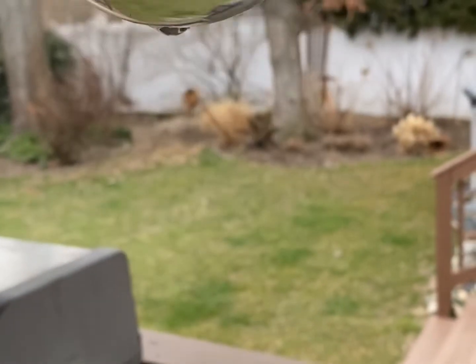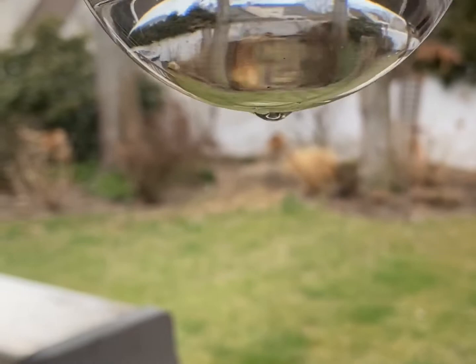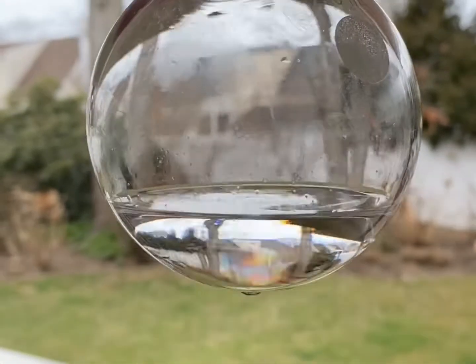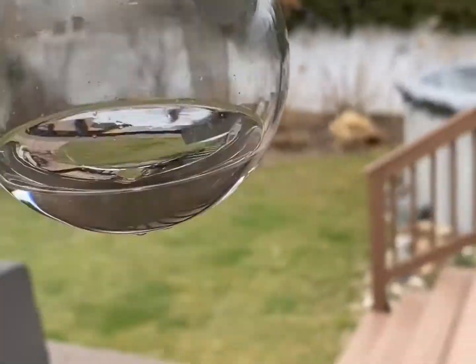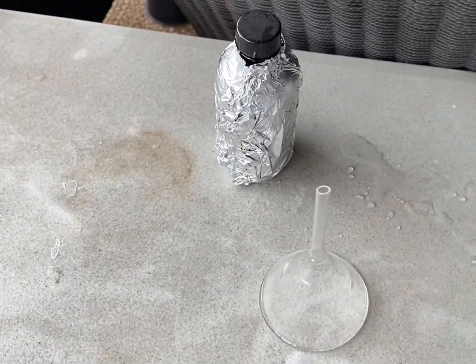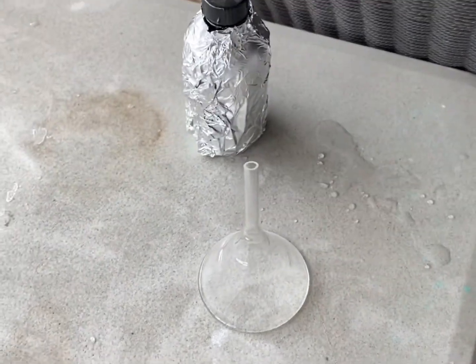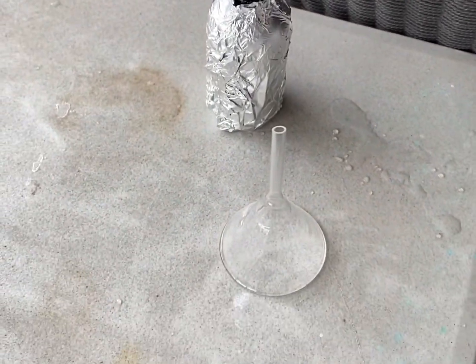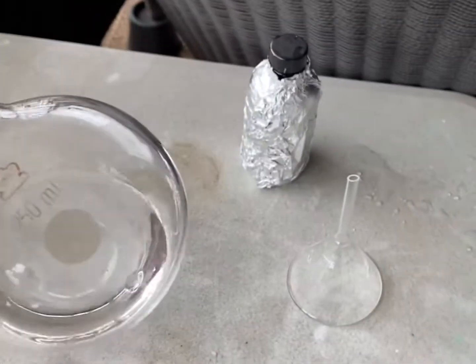Here we have our final yield of chloroform, about 75 ml, to give a 55% yield. And as you can see with chloroform, it has a pretty cool optical density, so it refracts light very differently than water. And so everything that you see through it looks pretty cool. But I'm now going to store it in an amber glass bottle that's wrapped in aluminum foil to make sure that it doesn't degrade into any phosgene. And you can also add 1% methanol by volume or absolute ethanol, but I'm using mine soon, so I don't plan on doing that. Well, anyways, I'm gonna store this and then we'll move on to the phenol synthesis.